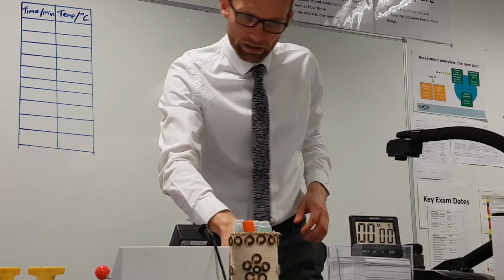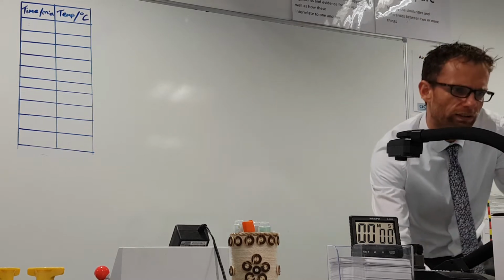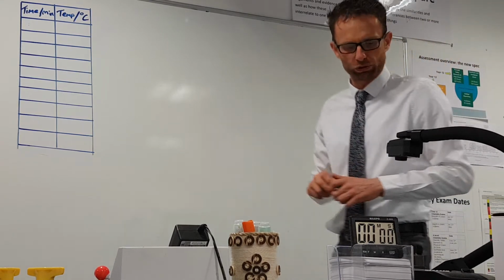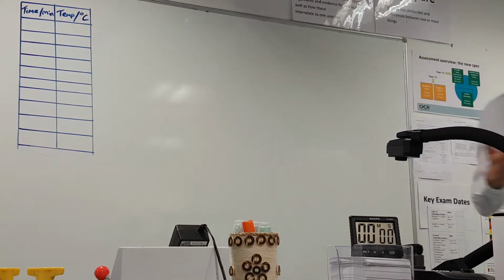Okay, hi everybody. I'm going to take you through PAG 3.1, which is your chance to determine the enthalpy change of neutralization. So the technique you're going to use here is pretty straightforward. It's one that you've seen, that you are quite familiar with the basics of.